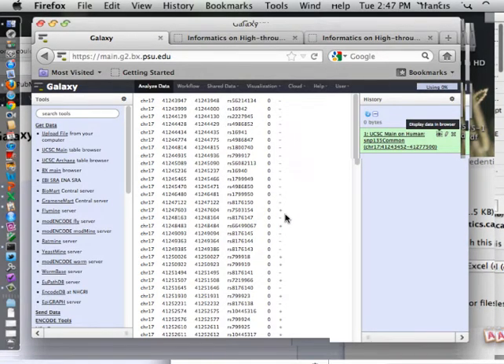It's chromosome position in all these intervals. So they're all one nucleotide intervals. They all have an RS number. That's a SNP number, a dbSNP number. They all have a zero here, which doesn't mean anything. They all have a plus or minus here, which tells you the plus or minus strand. Okay? What was the zero? It's an empty column. They stuck zeros in them. It doesn't mean anything, so don't worry about it. Everything's got zero.